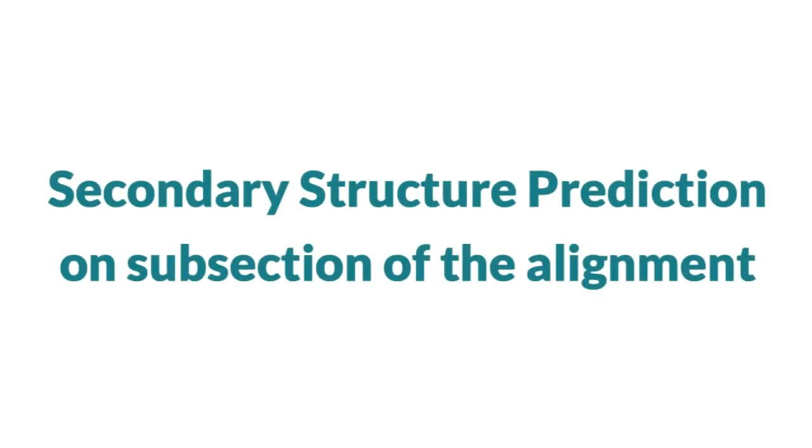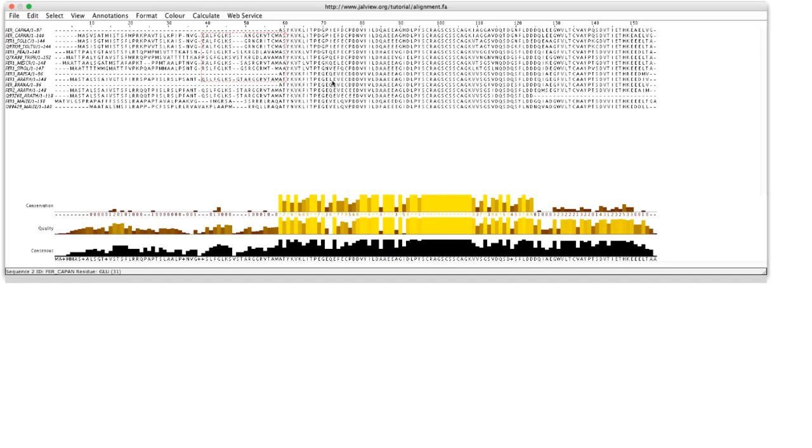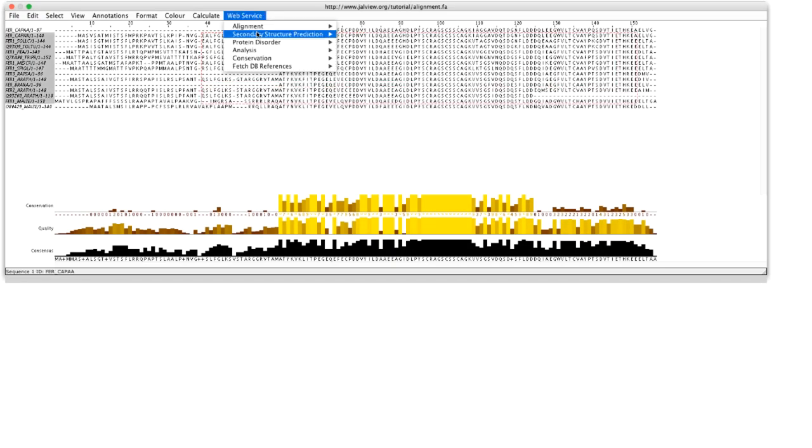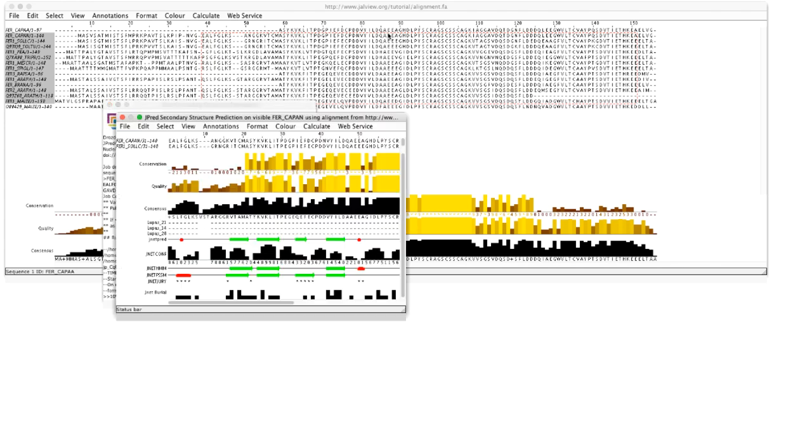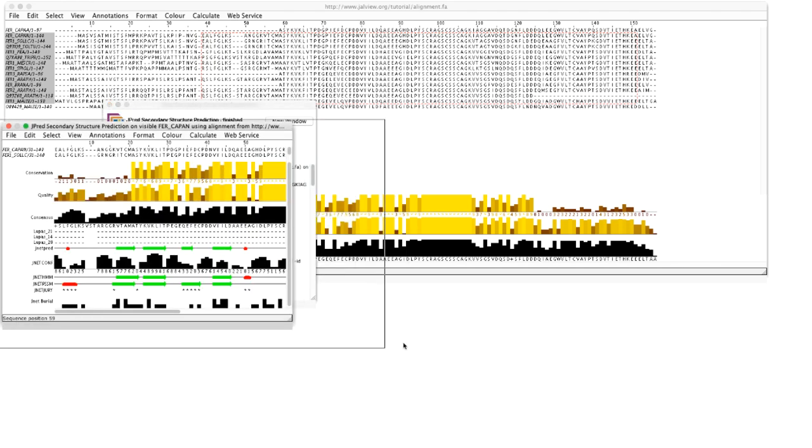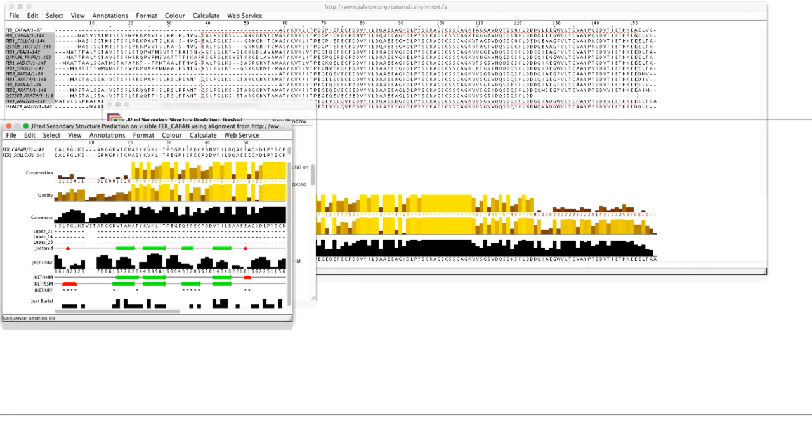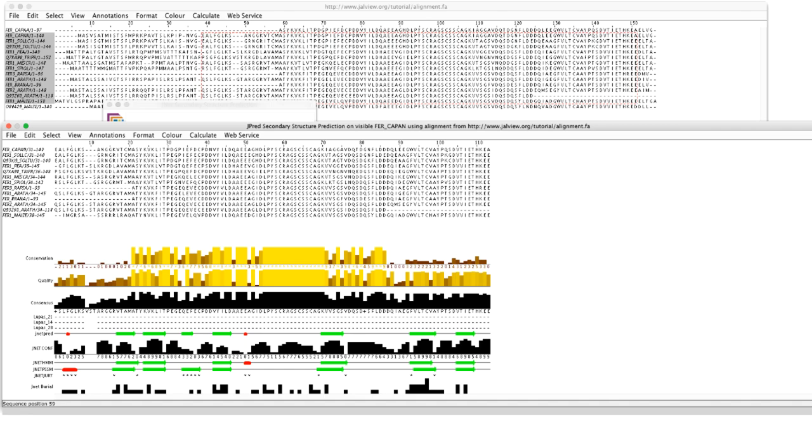The JPRED secondary structure prediction can be performed on a subsection of the alignment if the alignment is aligned. JPRED uses this selection as the profile to perform the secondary structure prediction. The first sequence in the set will be used for the JPRED prediction.